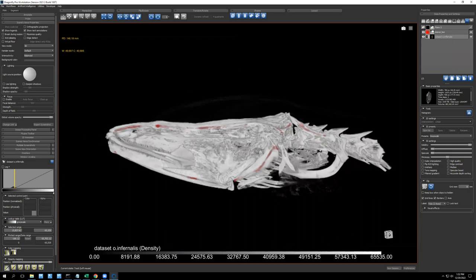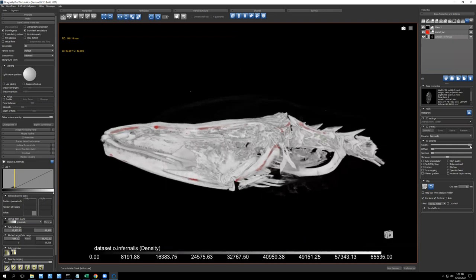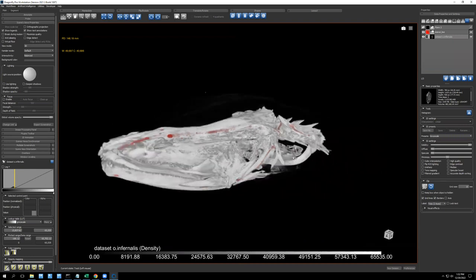But when you save and open these session files, it doesn't keep any type of 3D settings. So if you had made a really nice preset, made it look really nice over here with the LUT, and you close it, that's gone. You have to redo that.